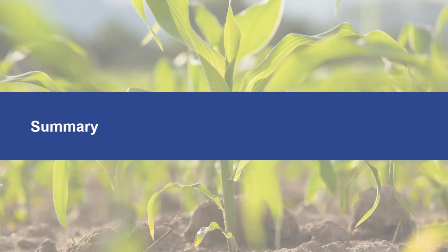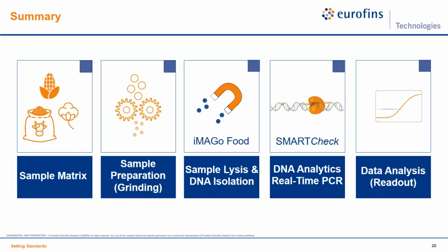Thank you, Anja, and I hope we deciphered a bit the world of GMO testing for you in the last couple of minutes. I'm just wrapping up, because we started with that slide. I want to end with that slide showing you, okay, GMO analysis is not just the PCR, but it definitely involves upfront sample treatment, looking at your sample that is involved, as Anja mentioned as well, then the subsequent DNA isolation, and then looking at the content of the DNA. So are you expecting a low? Is it a high process matrix or not? Can you expect a higher DNA concentration before you're entering your DNA analysis using real-time PCR?